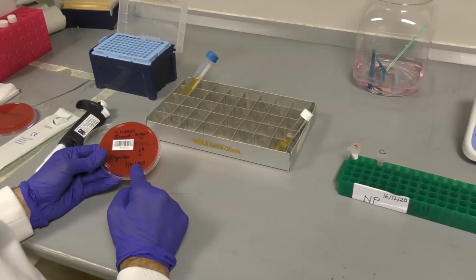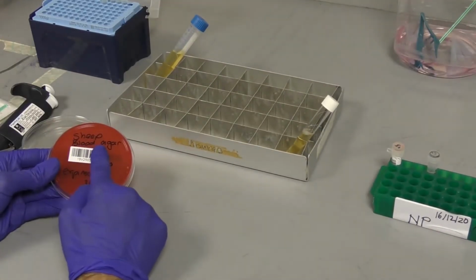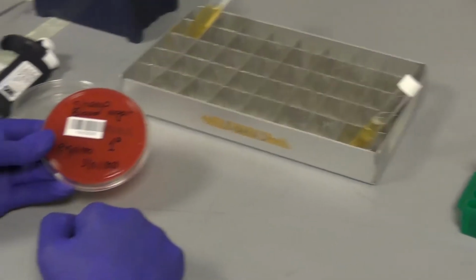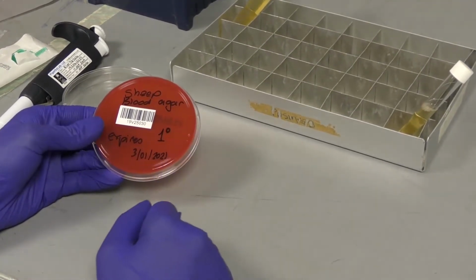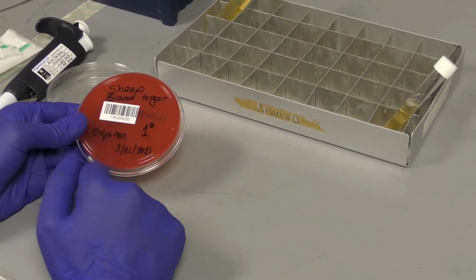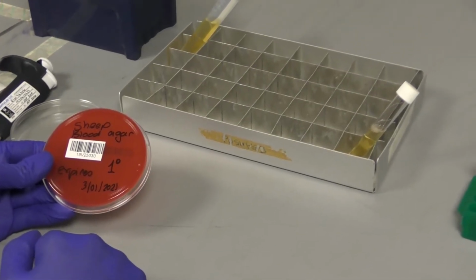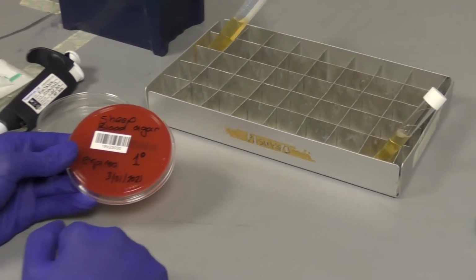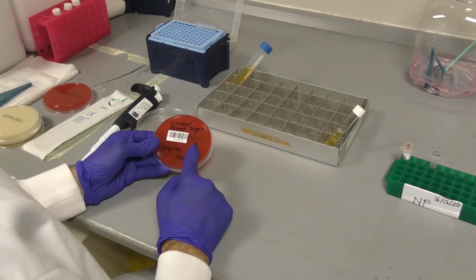Ensure that the plate is in date. It should be labelled with an expiration date, and that it is labelled with the plate type, i.e. sheep's blood agar. You will then need to add either a barcoded label or manually label with the specimen details and the date of processing. The plate will also need to be labelled as a primary plate, i.e. 1 and the primary sign.